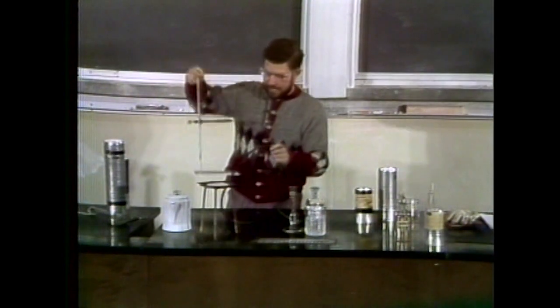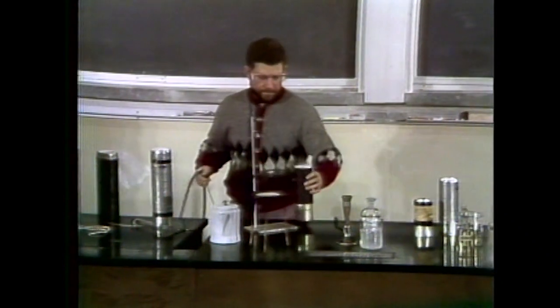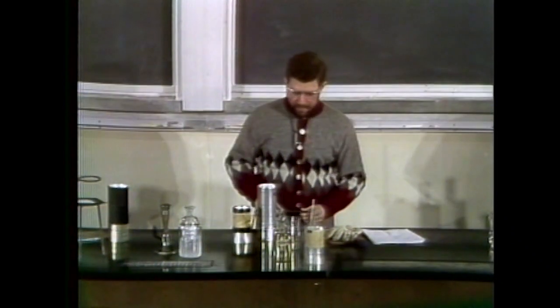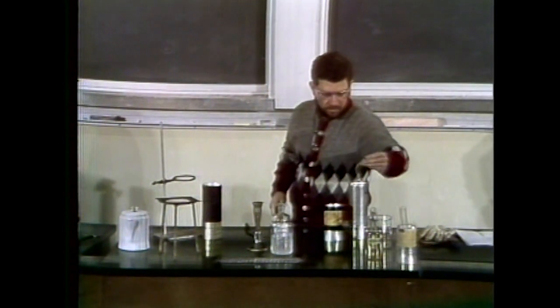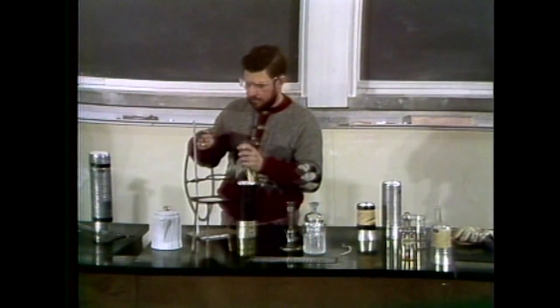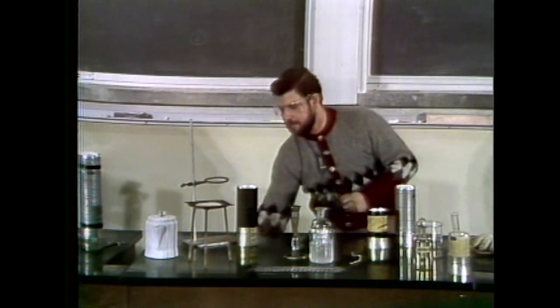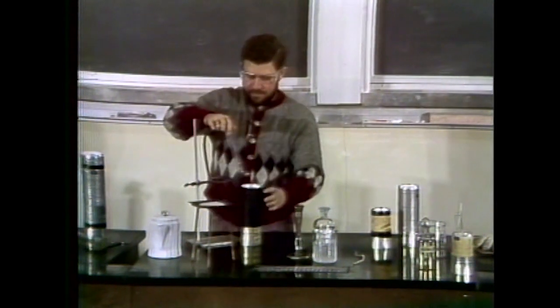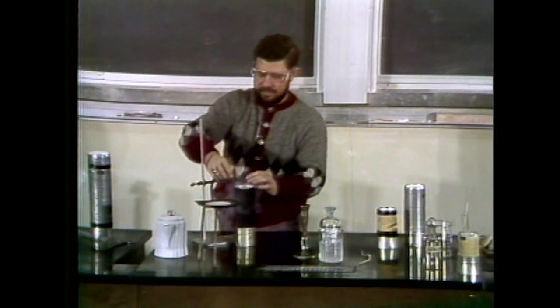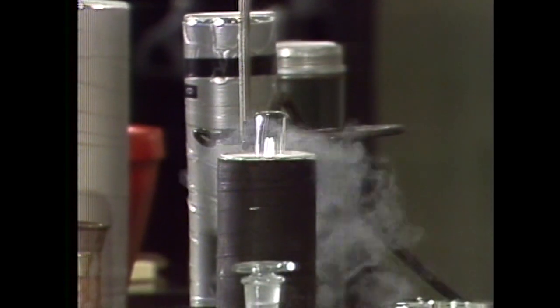And I'm going to use also the same hydrocarbon we had just looked at. That is the methane. And I'm going to liquefy the methane by cooling it down to liquid nitrogen temperatures. And so what I'm going to do is connect this to the gas outlet, turn the gas on, and just let it condense. The gas that I'm bubbling through will condense in due time.